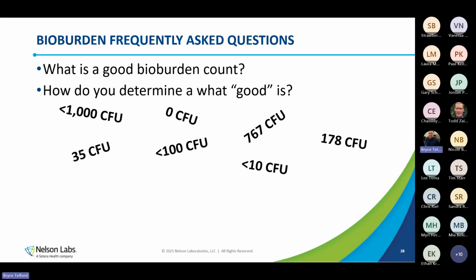So when we're talking about raw counts, so just what we're seeing on the plate, I might see a 0. However, all of the bioburden testing that we do has a limit of detection. So our most sensitive is that MPN test. It tends to be for 10 samples 0.11 CFU. So it's very close to 0, but we're not at 0. If I'm doing an extraction, so I'm removing it from the product and I have that liquid in bottles and stuff, I'm probably going to see something more along the lines of a less than 3, for example.